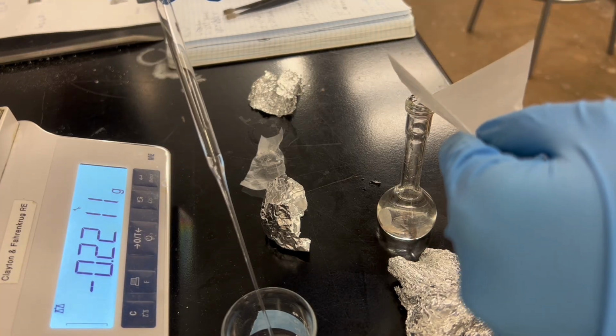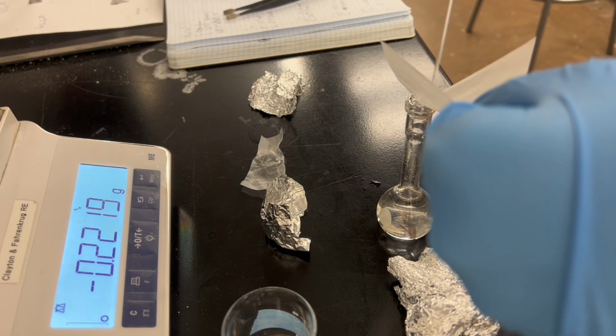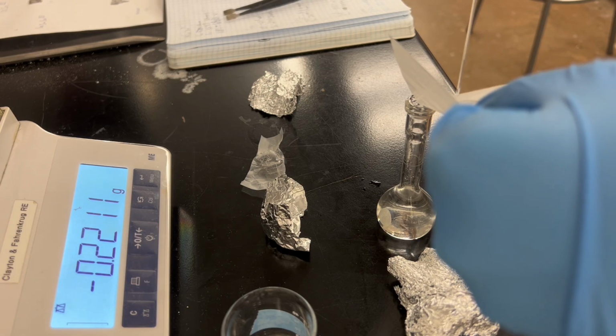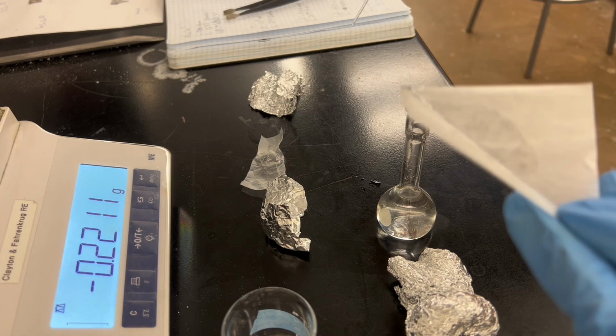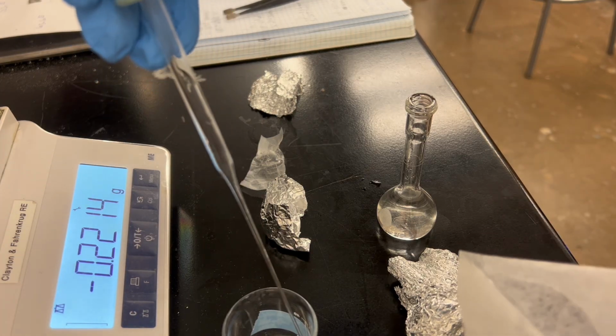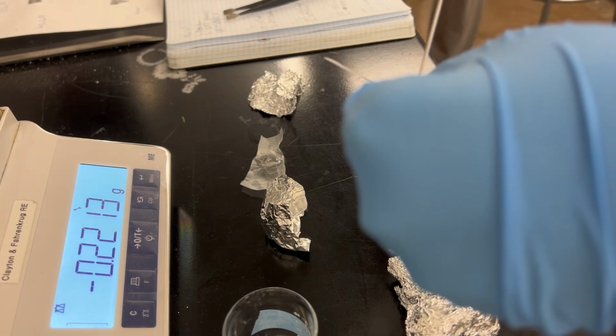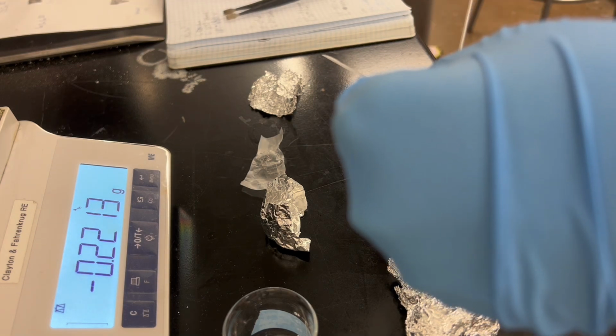For the sonication of the solution with PFAS, make sure to sonicate it for less than 30 seconds and make sure there's no bubble, because it will help the PFAS aggregate in the solution on the top.